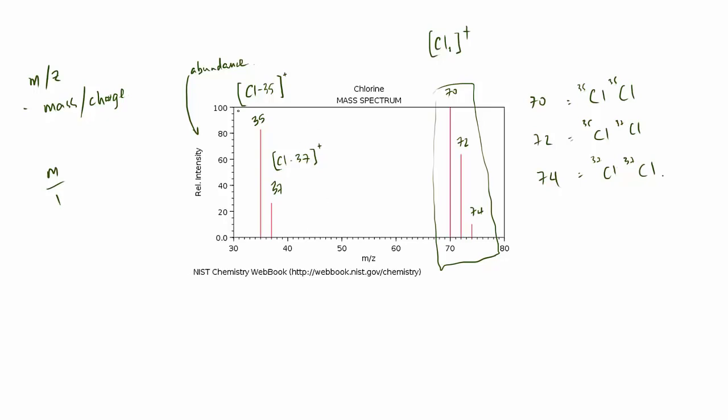Now, flip back to there very quickly before I show you another molecule one, just for reference. We can see the ratio here. Basically you've got a third. This is a third of that height. So your ratio is 3 to 1 in terms of the actual abundance. We can see that visually here, and this is a real spectrum.